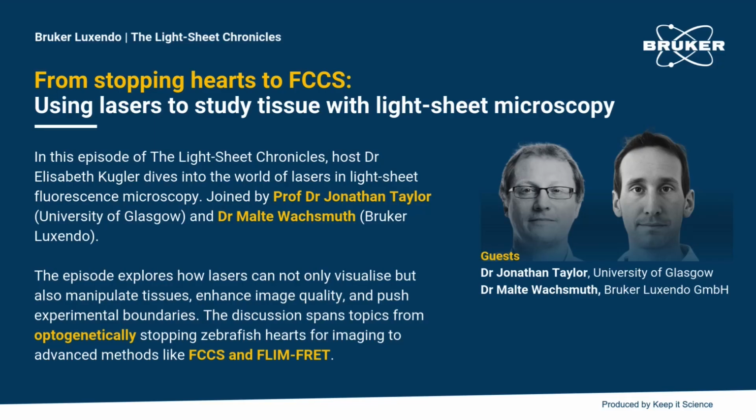It's fabulous to have you both here today, and we're going to talk about loads of fantastic things. And the first one we're going to talk about is actually how we can use the light sheet to improve image quality. So we know that in most imaging techniques, there is unfortunately some forms of artifacts, and artifacts can obscure details and reduce the accuracy, especially if you want to do quantitative analysis. So Malte, can you tell us about the different strategies that exist to address artifacts?